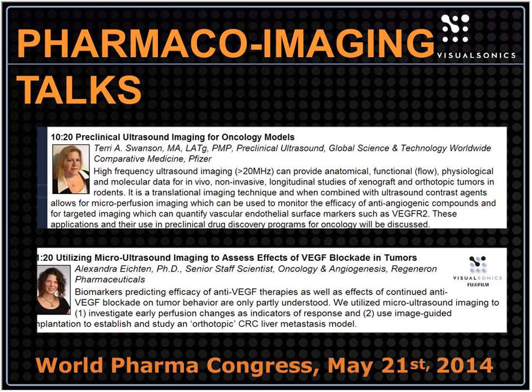I'd like to also thank our pharmacoimaging speakers who recently gave their talks, one from Pfizer and one from Regeneron, at the World Pharma Congress. They talked about the efficacy of lead candidate drugs, and also the use of preclinical ultrasound imaging in oncology models, especially in this day and age where there are clinical attrition rates of these drugs, and there's a need for the right model in which to address the preclinical evaluation of lead candidates.